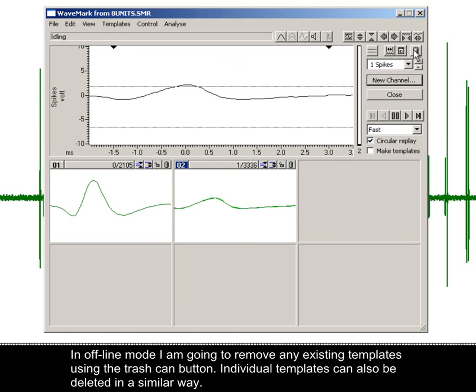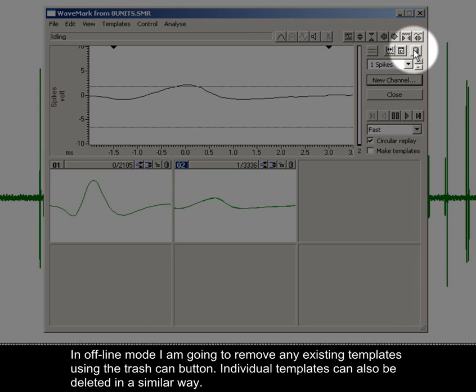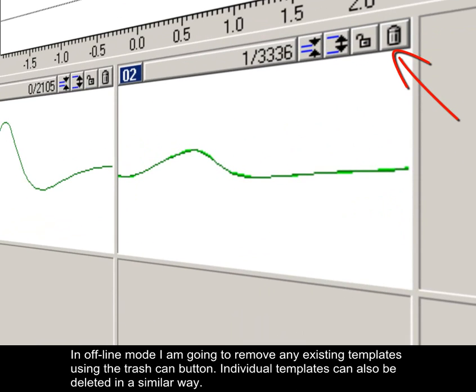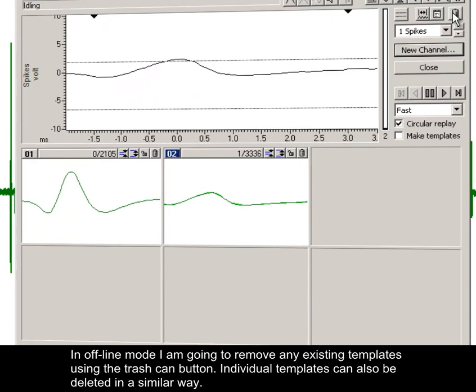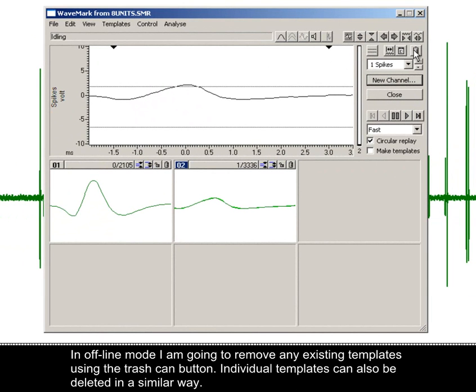In offline mode, I'm going to remove any existing templates using the trashcan button. Individual templates can also be deleted in a similar way.